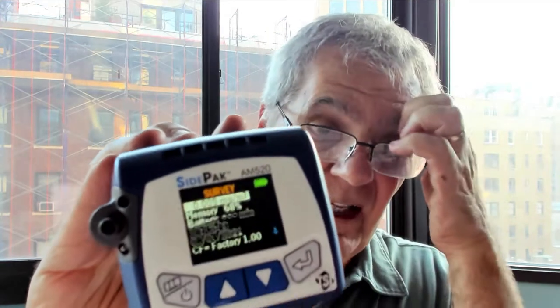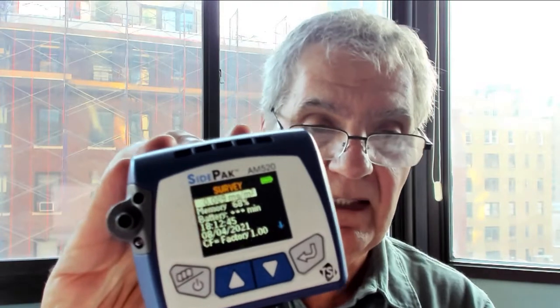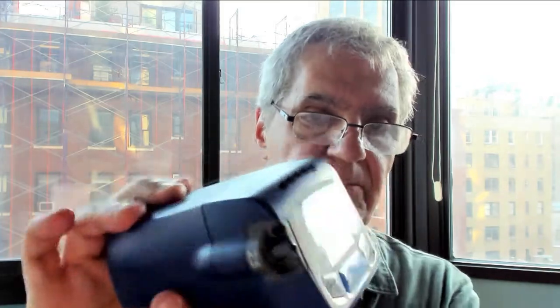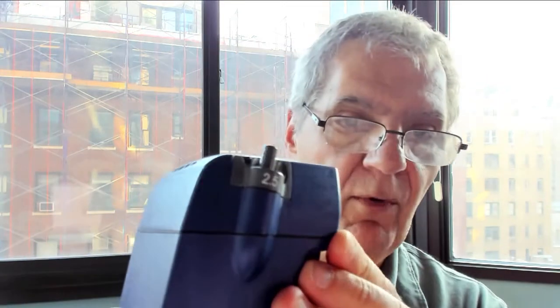Let me go back to survey mode. This is the survey mode and you see it's spitting out data — it's taking a reading every few seconds, and you can adjust that. Notice the 2.5 orifice is already attached, so you don't have to worry. It's measuring PM2.5.